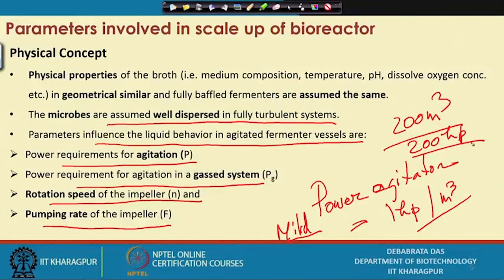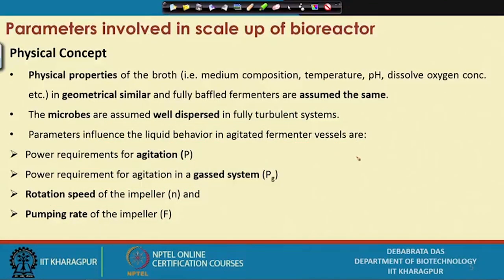So in the purpose of the scale up, we shall also have to look into what should be the minimum power requirement in the agitator to get the maximum amount of product. This is also another very important thing. Now, another important thing is the gas system and non-gas system.